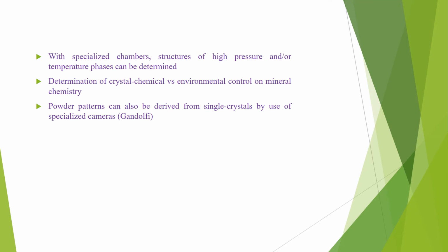And also the determination of the crystal chemical versus environmental control on the mineral chemistry can also be studied by using this technique. And the powder patterns can also be derived from single crystals by the use of specialized cameras. These cameras are known as Gandolfi or similar cameras.